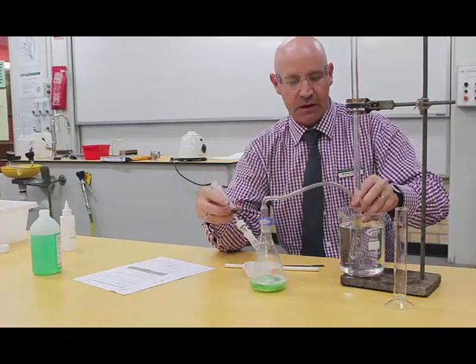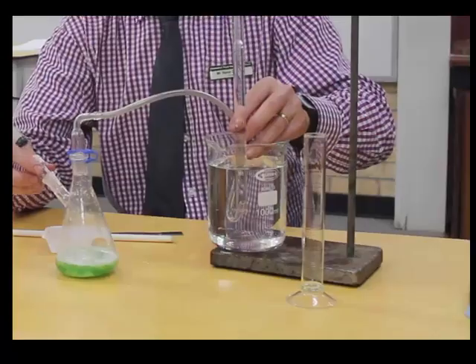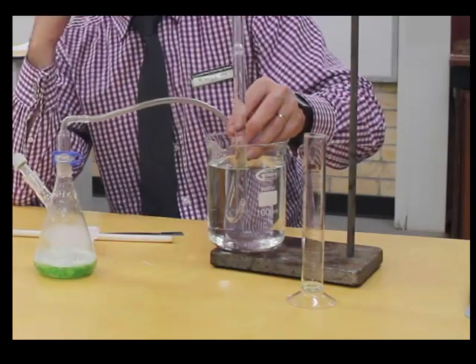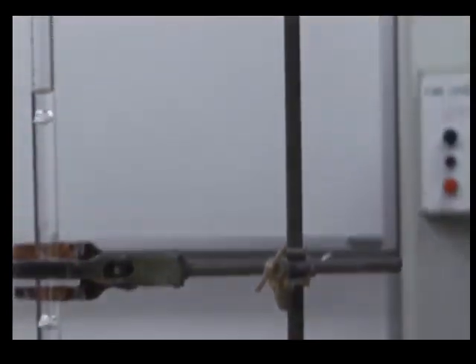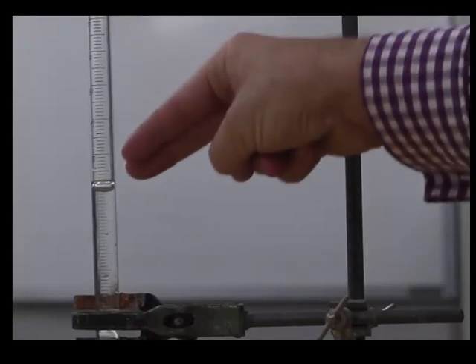And what we're going to expect to see now is actually the oxygen being produced by catalase breaking down the hydrogen peroxide. And as you can see where the meniscus there is on the measuring cylinder, we can take a reading of how much oxygen is being produced.